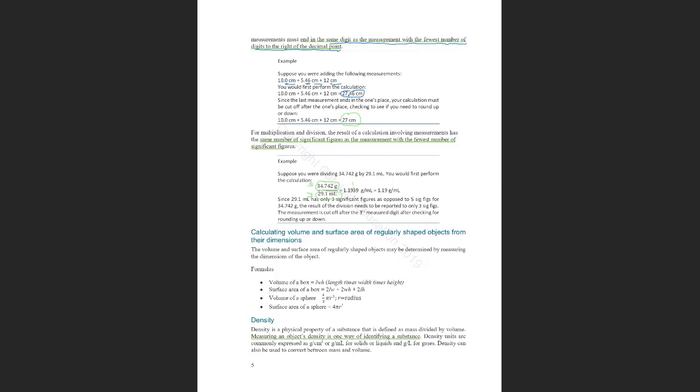Thank you. You're welcome. So here, basically it's all about measurement and doing calculations. The whole report is about measuring, and these are formulas to do calculations. You are going to calculate the density of an object, and the density, you know, is mass divided by volume.